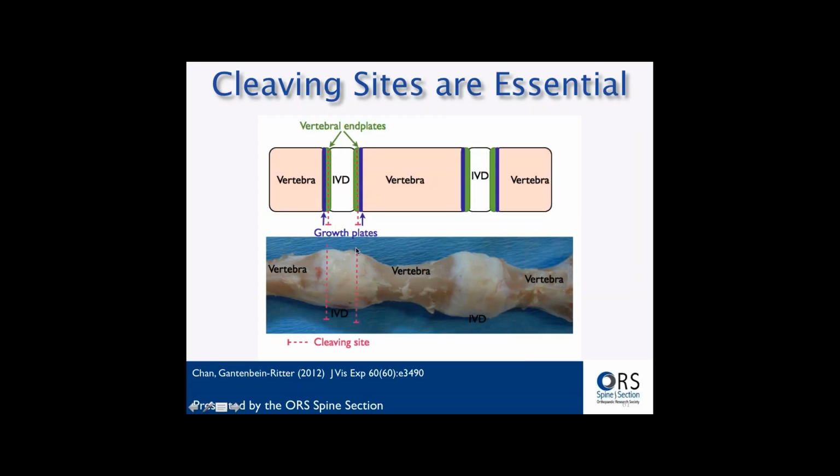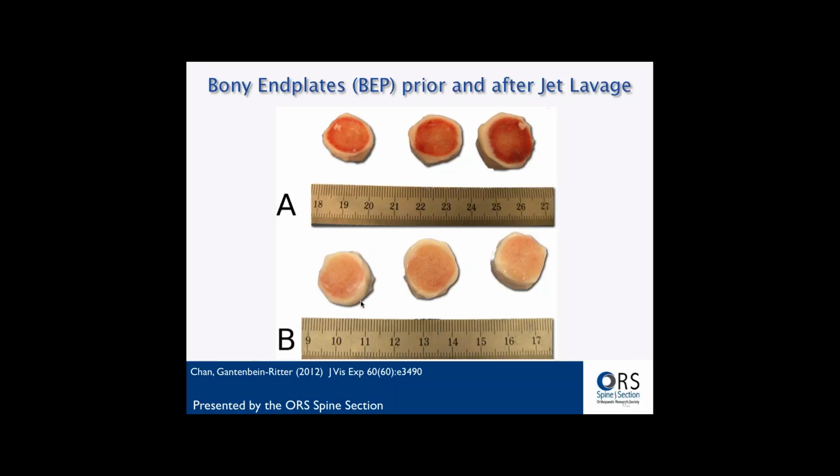So here, this has to be done manually, and you really have to get a good feeling for where to cut. It can happen sometimes when you start doing that you lose some discs because you cut through the cartilaginous end plates. So you should ideally leave 1 to 2 millimeters of this bone here. For us, it was important, as Fackson Mwale already mentioned, to keep a nice and clean surface. This is before the jet lavage system with a Ringer solution we use, and then we also add sodium citrate, and the full protocol has been published.